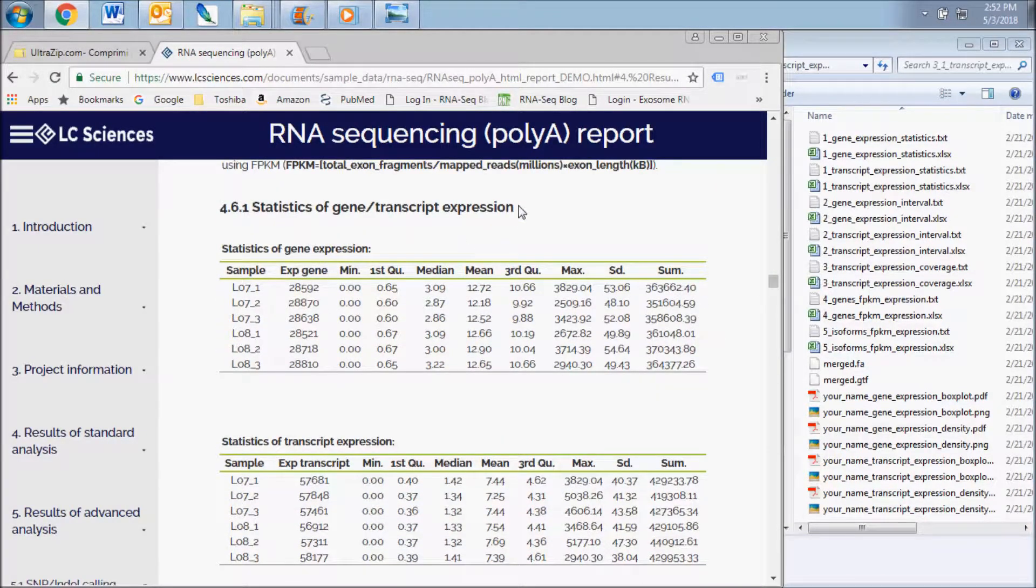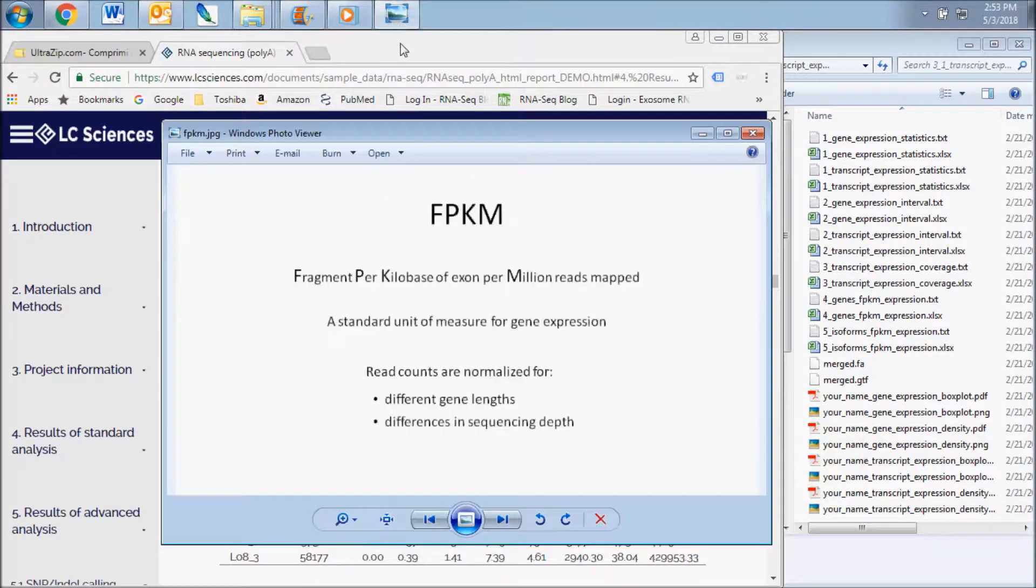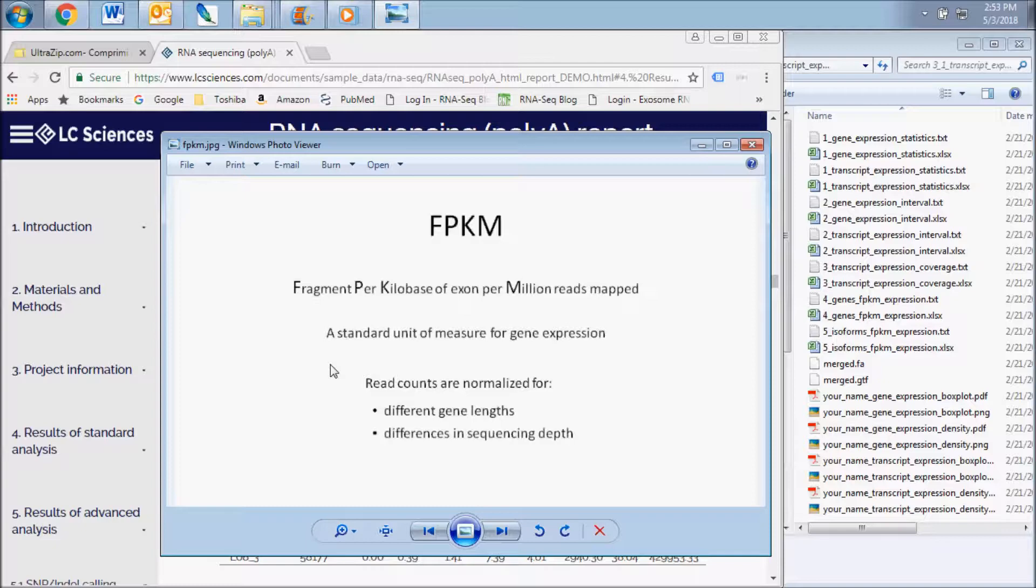Charts and graphs from this point forward contain expression data and statistics based on FPKM calculations from raw read counts. FPKM refers to fragment per kilobase of exon per million reads mapped and is a standard unit of measure for gene expression.